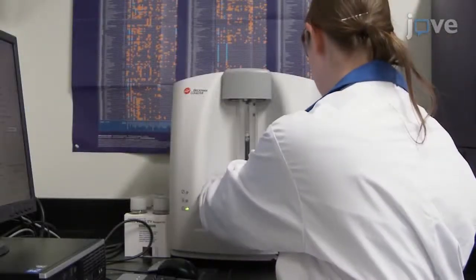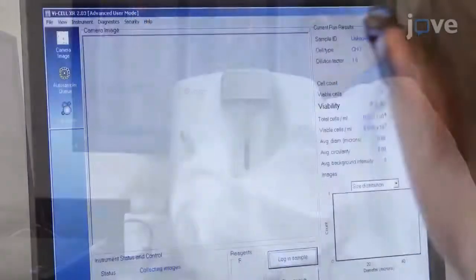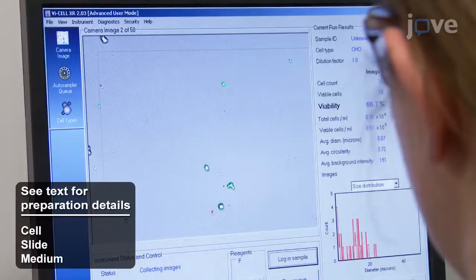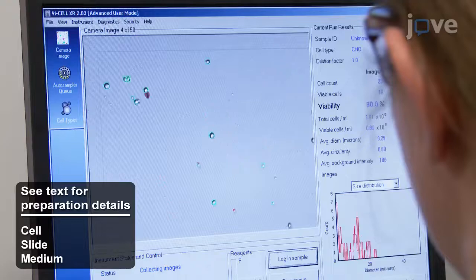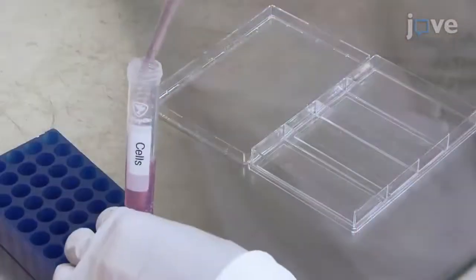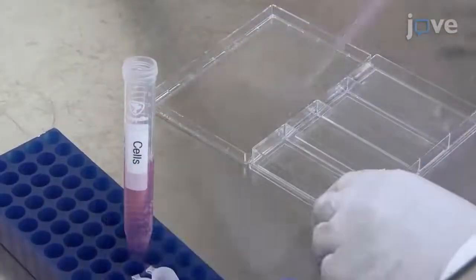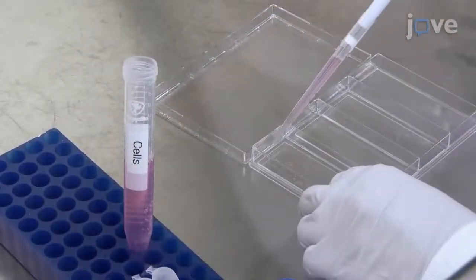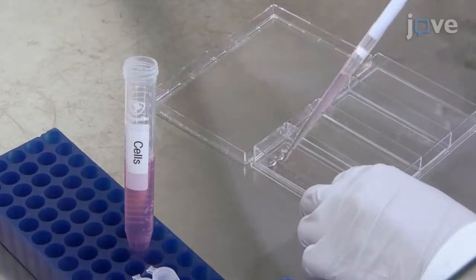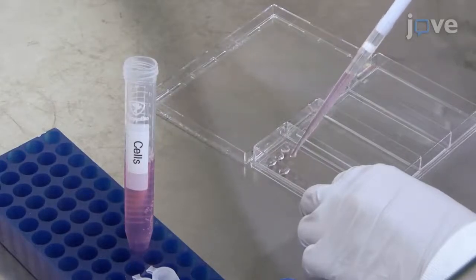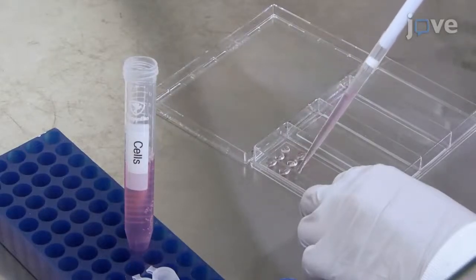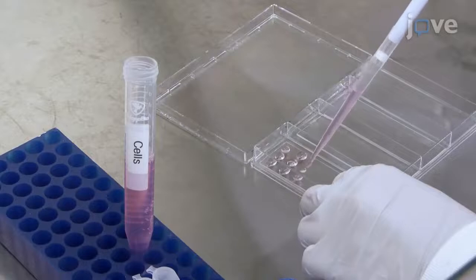24 hours before the analysis, count the human endothelial cells at an early passage, and seed approximately 1×10⁶ cells in 1 mL of medium onto 1 fibronectin-coated glass slide per well of a 4-well cell culture plate.